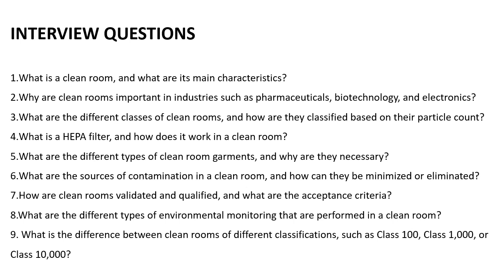Then how are clean rooms validated and qualified, and what are the acceptance criteria? This question is actually for very experienced candidates who have already worked on validation of clean rooms. Only for those can this be an interview question. Then what are the different types of environmental monitoring studies that can be performed in a clean room? For example, for a microbiologist, you do plate exposure, that is bioburden testing, right? Then yes, there are temperature and humidity testing, etc.